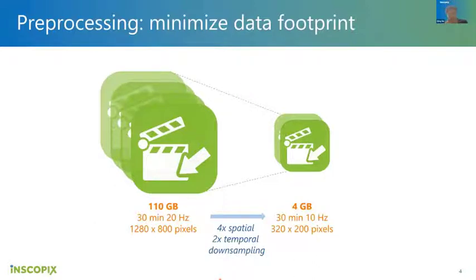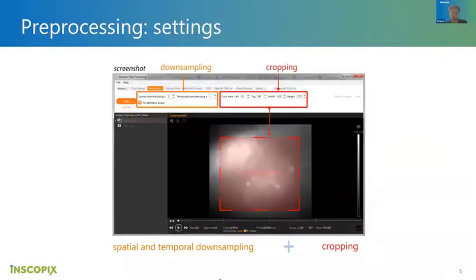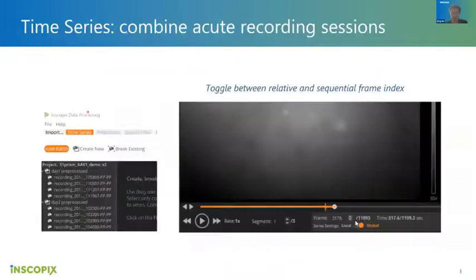you export the CSV file, I noticed the timestamp is actually not consistent with the movie shown. The movie has no gap, but when you export to the CSV, I think the original absolute time was preserved. Maybe we can give the option to either keep the gap or keep everything continuous. That way, each time series will be treated as one big movie, and it's probably easier to do the following analysis, right? Is that something you feel, because the gap makes some analysis more difficult?